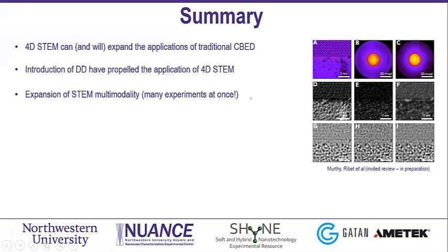And this is a nice example made by Dr. Akshay Murthy and Stephanie, who is on the call here, using graphene with gold nanoparticles, and then you can create different images basically just using the diffraction pattern here. You can enhance the carbon contrast. You can enhance the higher Z material contrast. So basically, trying to overcome this challenge of imaging interfaces, especially soft to hard materials.